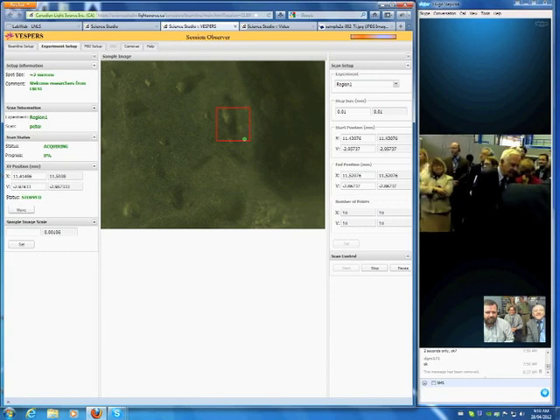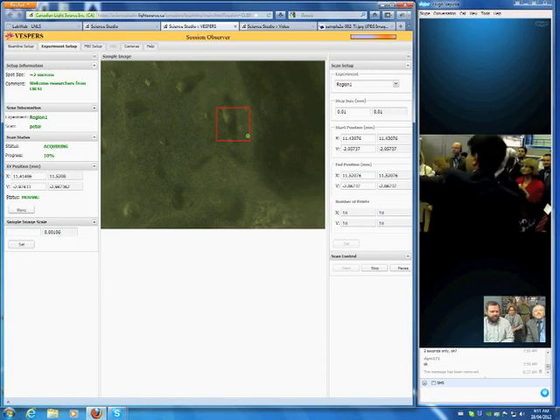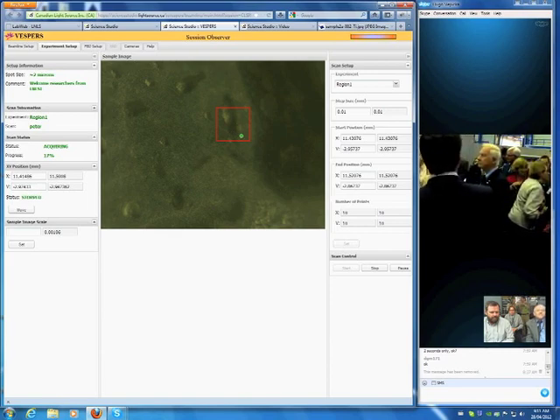What you see is that at one of these points, you see a spectrum that is live. What's that big, tall peak? It's a concentration. In this case, it's the concentration of iron. But we have different elements. So basically, you can probe the concentration of that. And this is the experiment that is being done. So you see, it's very complementary to what we do here with the structure. There you look at concentration of chemicals.